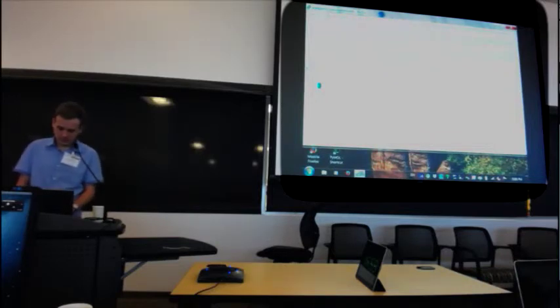So let's have a look. Few jobs. Oh, yeah. I don't know why it's still running. Probably there's something wrong with the submit config.